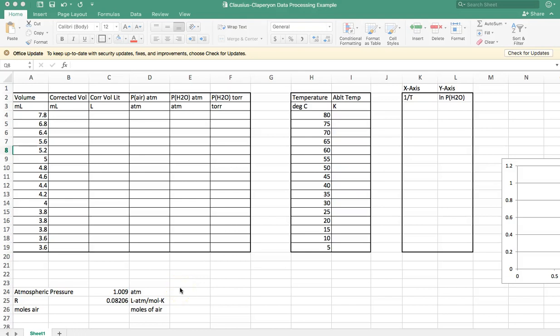Hi everyone. So we're just going to do a quick YouTube video going over how to process the data for our Clausius-Clapeyron lab. What I have up here, all I've done is put in data that I've collected in past semesters, so it might be a little bit different than yours, based on whatever the temperature and pressure was in the room. You can see I have my columns for volume and temperature already filled in.